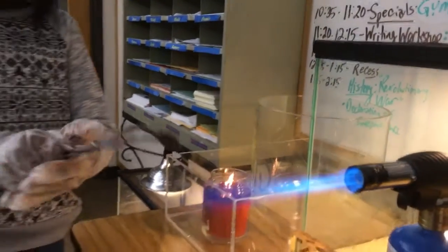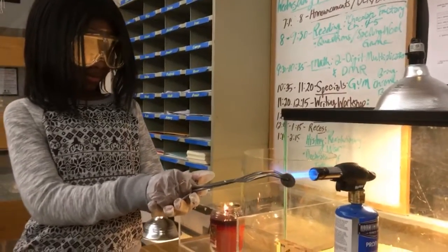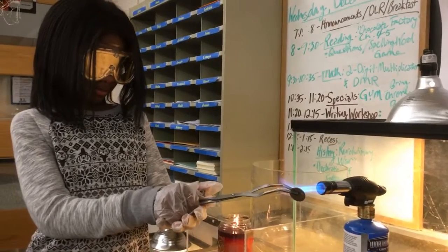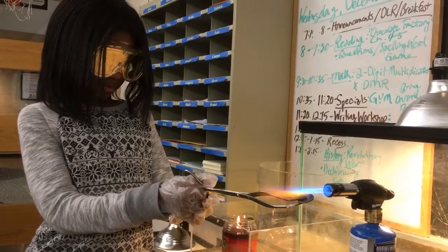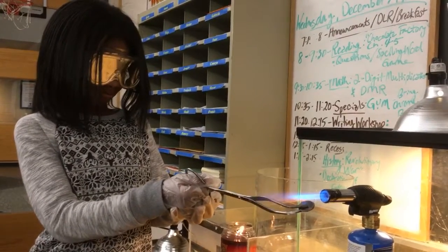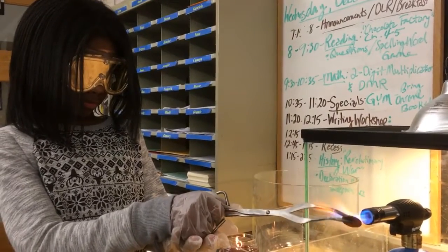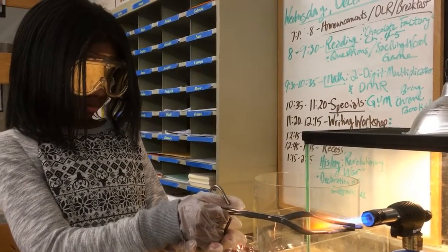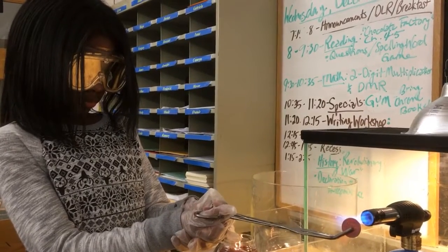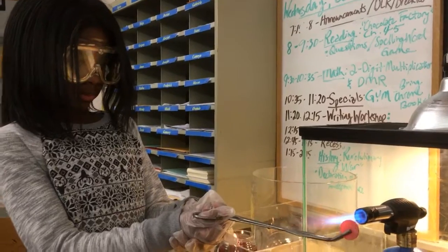Here we go. Alright Jada, put it right in there. Now as you do this it's really best if you hold it sideways, face on — turn it the other way. There you go, face on just like that. Keep it in there, it's got to get really hot. Okay, now put it in the methanol.